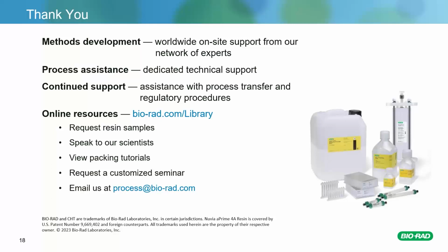And our next question is, has a mixed mode resin replaced an IEX and HIC step in industry? Is there viral clearance data?